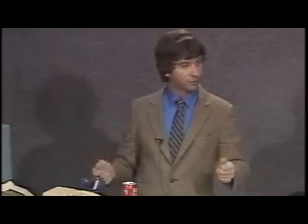We talked about field ionization, remember, the ability to ionize a gas atom in space close to the surface and therefore produce an image of the surface in atomic resolution. The other physical effect that we want to talk about is called field evaporation. Now, all of you are familiar with thermal evaporation. If we take a metal surface, for example, and we heat it to high temperatures, for example, by passing a current through it, we know it'll glow to incandescence, and metal atoms will be boiled off the surface.